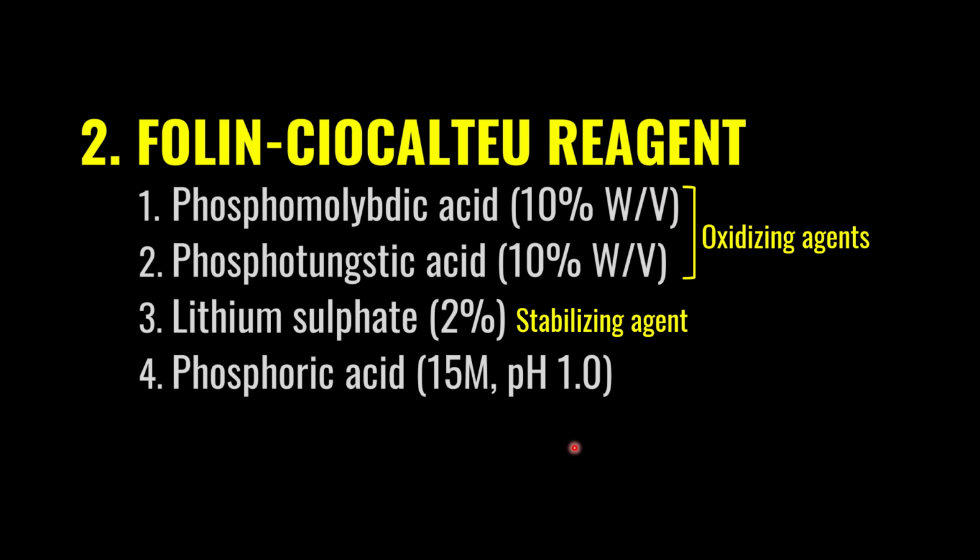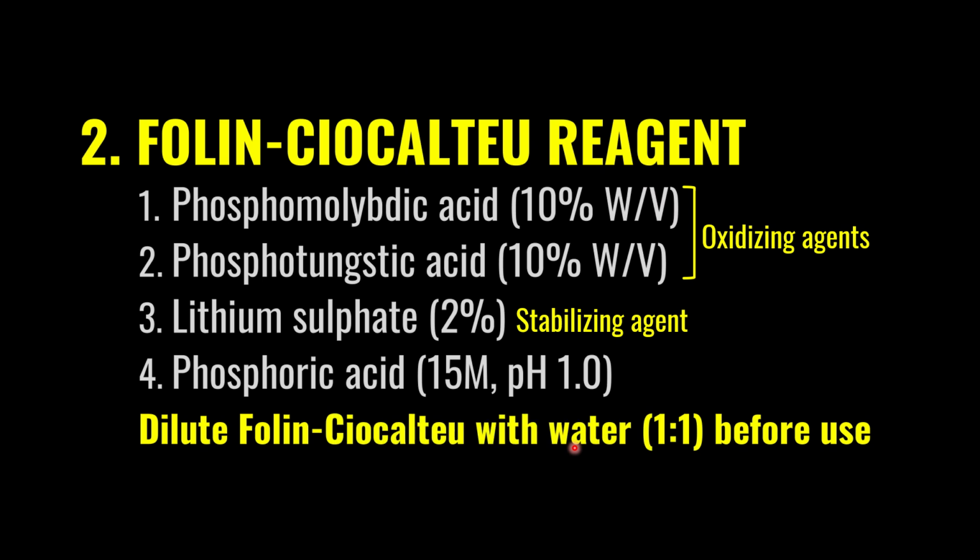So this is also diluted 1:1 with distilled water before use. You can buy these components from a company, but you should know the function of these components, so that if you have any problem, you can sort it out.